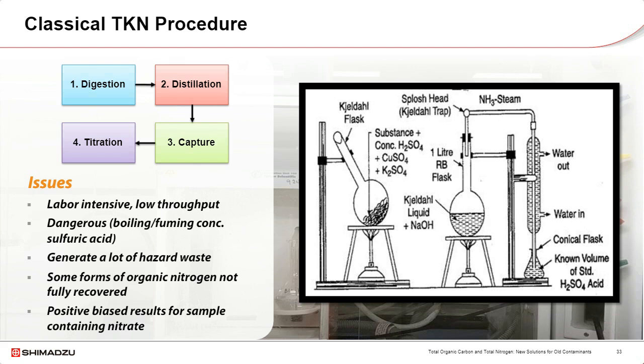So this method is very labor intensive, not to mention dangerous, and generates lots of hazardous waste. Additionally, some forms of organic nitrogen are not fully recovered, and in extreme cases, biased results have been reported for samples containing nitrates.